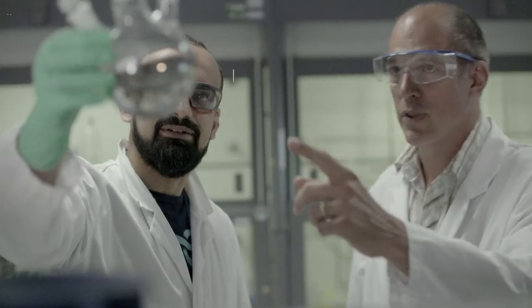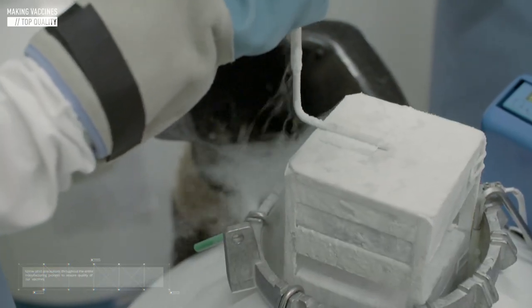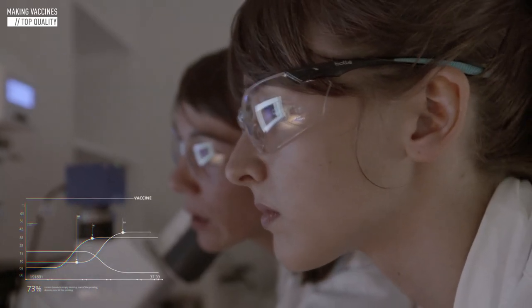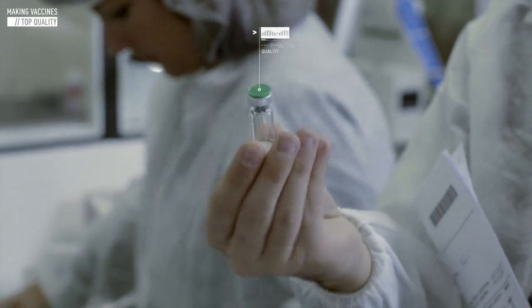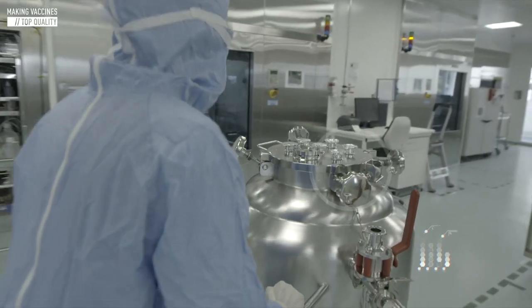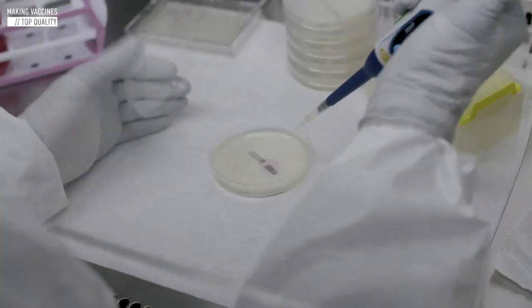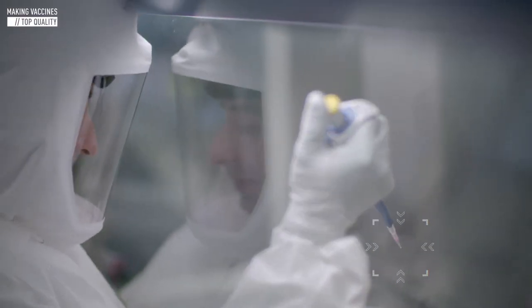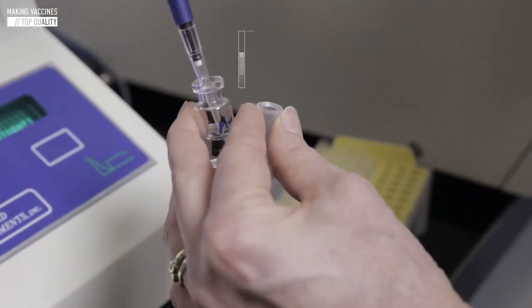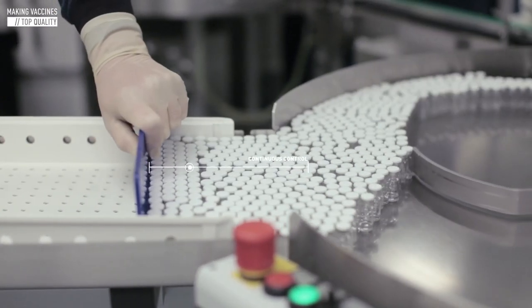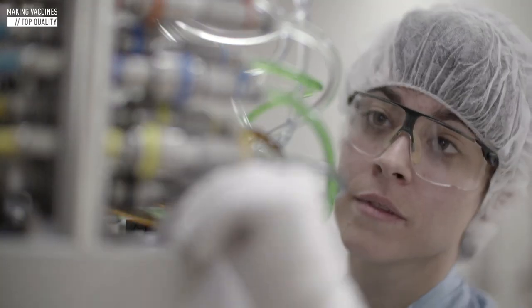Sanofi Pasteur takes care to follow strict precautions throughout the entire manufacturing process to ensure the quality of our vaccines. Production takes place in absolutely sterile conditions. Even the atmosphere is purified. Continuous control along the production chain also ensures that raw materials, equipment and manufacturing processes, and the finished product are of the highest quality.